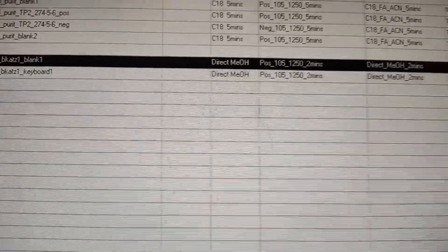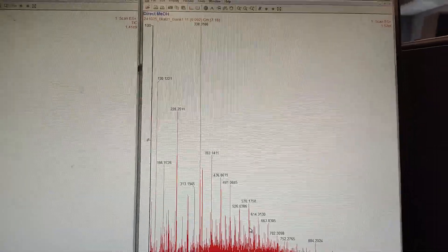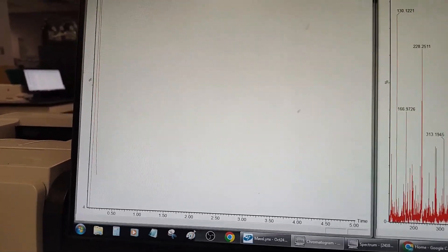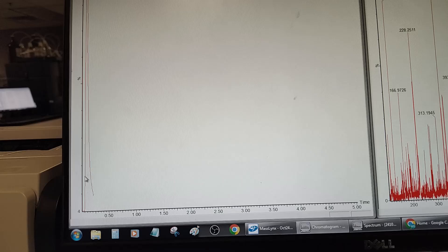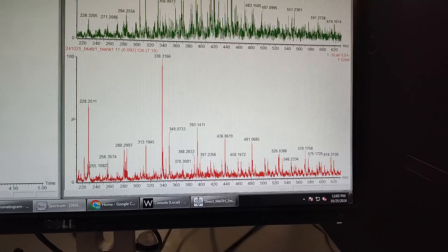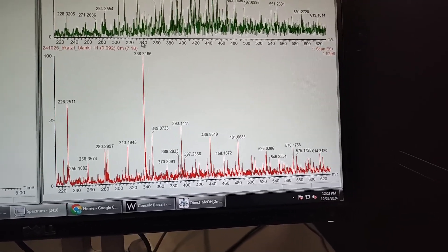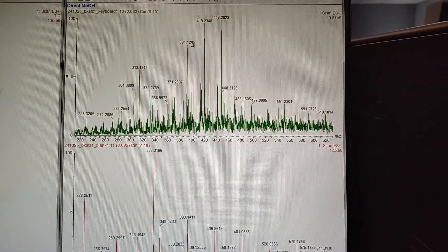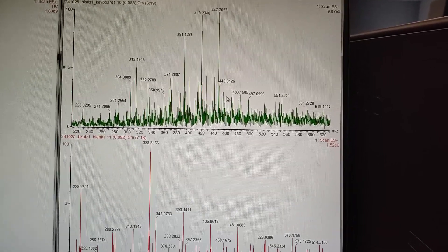We're running this on a direct injection method, positive mode. Running the blank first — you can see that's pretty blank. Now running the second sample; you can see the keyboard sample coming off. Click and drag to extract the data. We have something different. The new masses are mainly 391, 419, and 447.